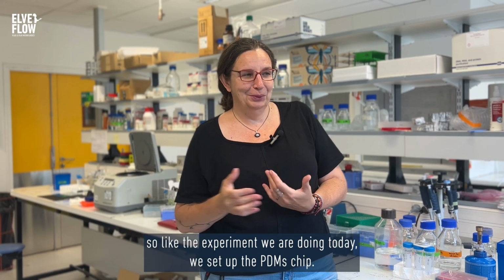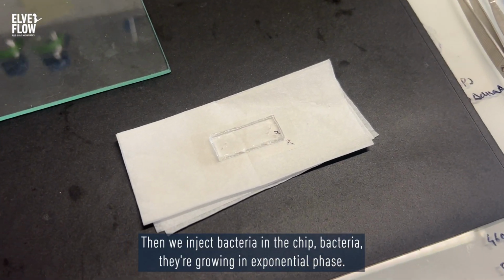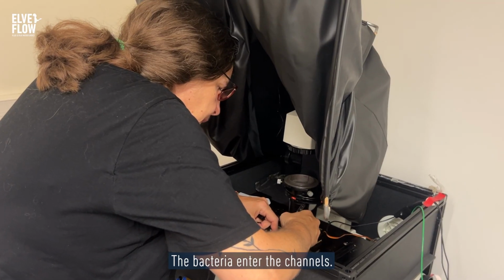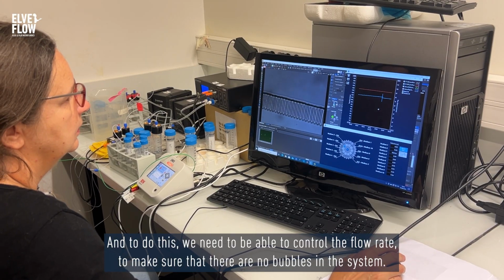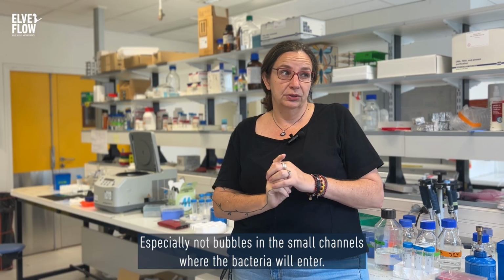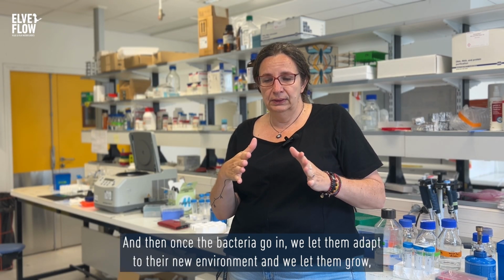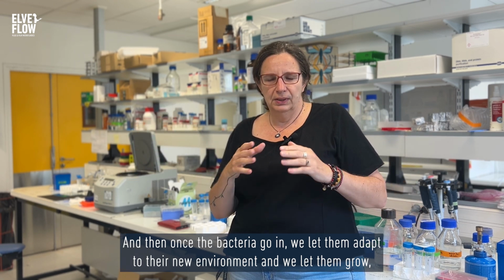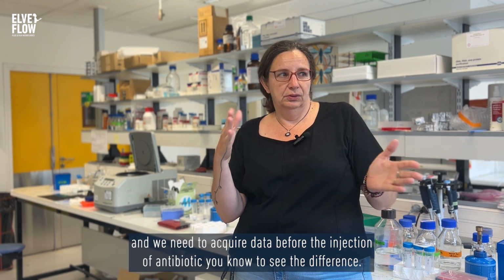Okay, so like the experiment we are doing today, we set up the PDMS chip, then we inject bacteria in the chip, bacteria that are growing in exponential phase. The bacteria enter the channels, and to do this, we need to be able to control the flow rate, to make sure that there are no bubbles in the system, especially no bubbles in the small channels where the bacteria will enter. And then, once the bacteria go in, we let them adapt to their new environment, and we let them grow. And we need to acquire data before the injection of antibiotic to see the difference.